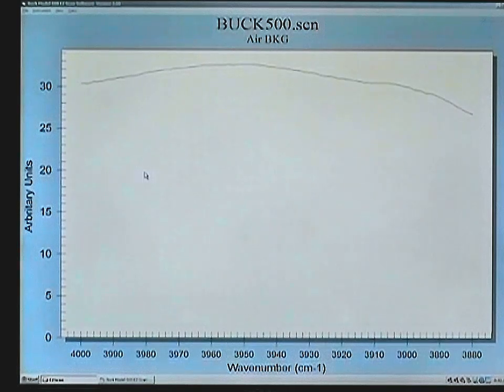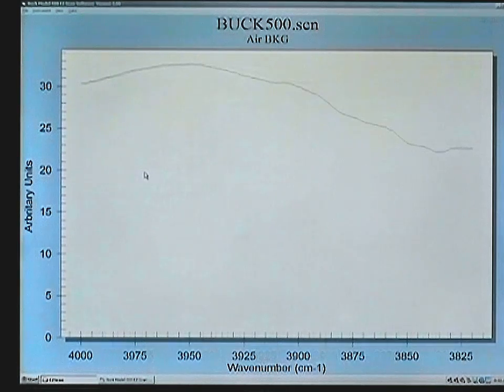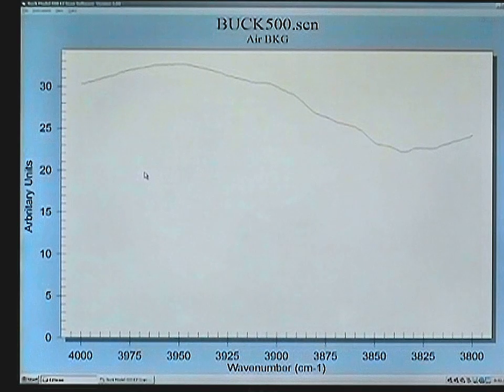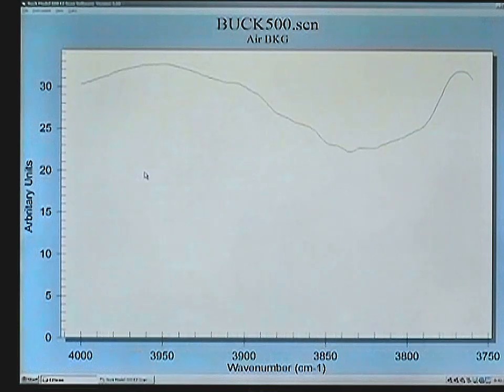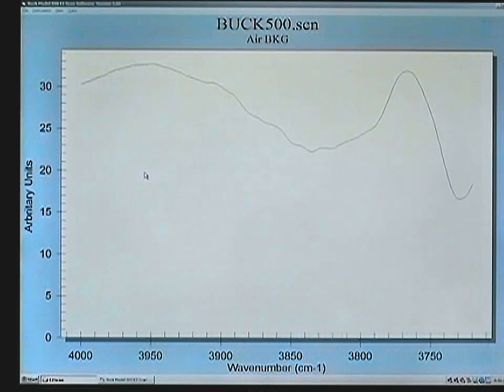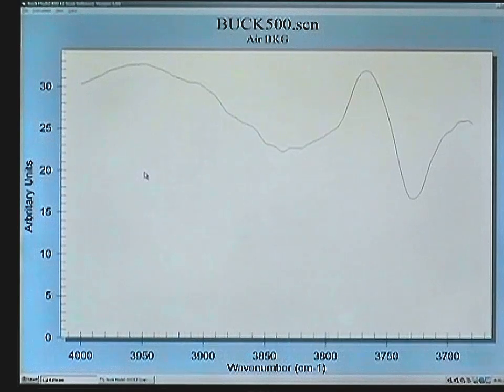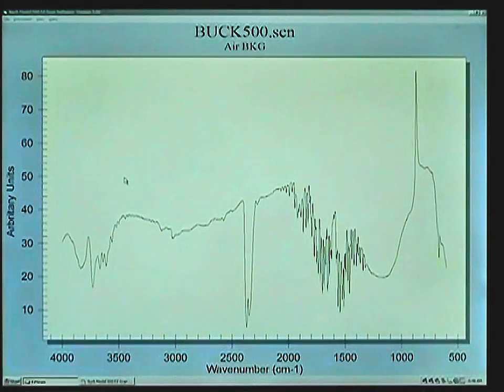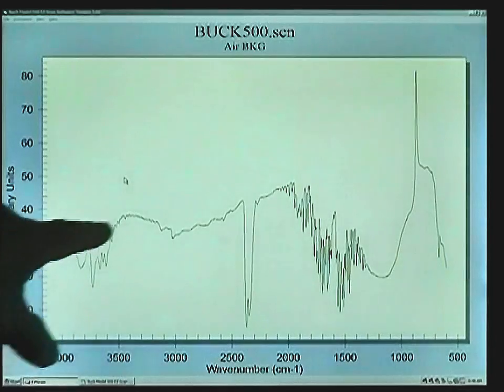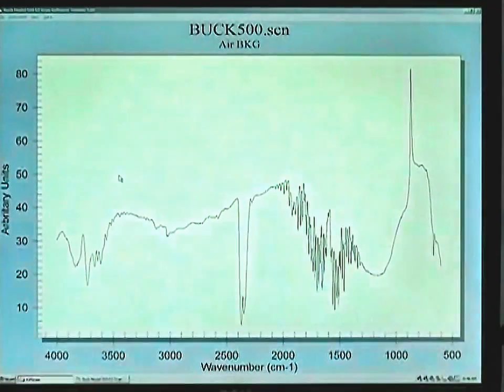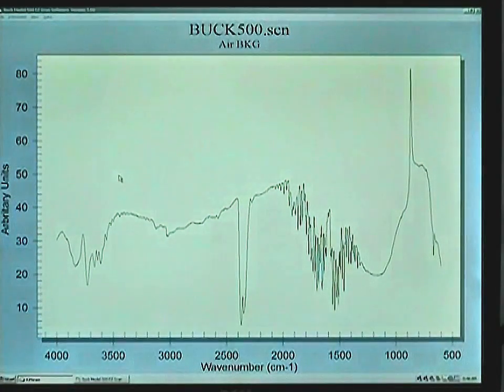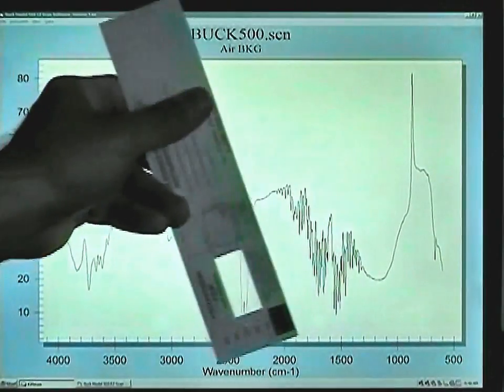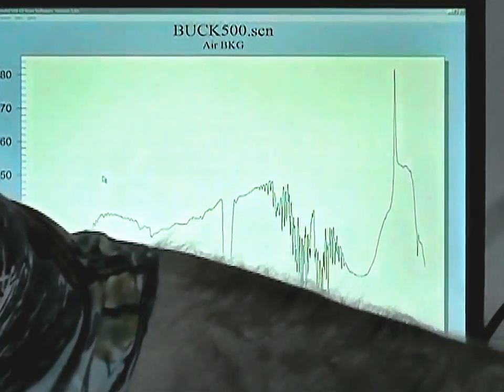The system will initialize itself and begin to collect the single beam data of the Air Background. When this is finished, we will run a polystyrene card and show how to create the percent transmission spectrum of that sample. When the single beam scan of the background is complete, you can see your profile of energy coming through the system. Take your polystyrene card and put it in the sample holder.